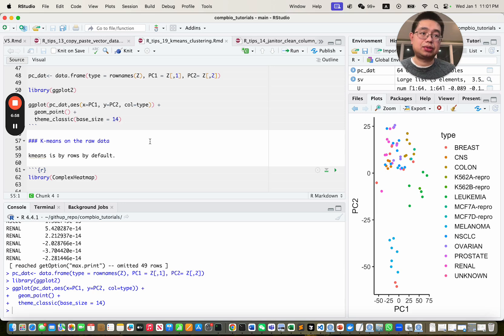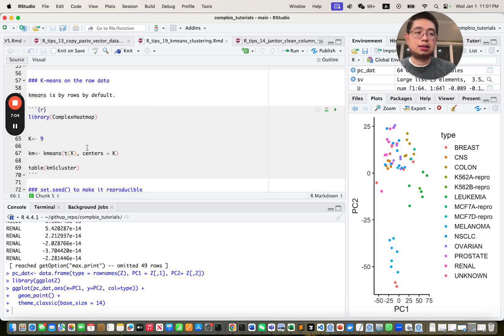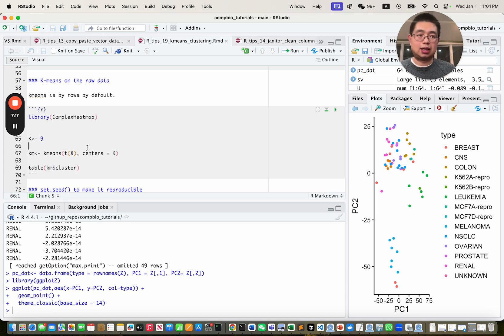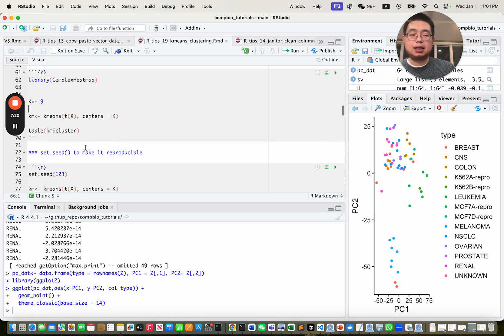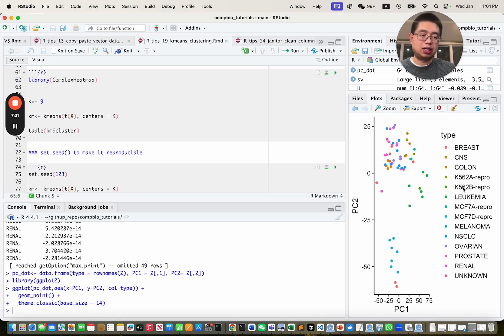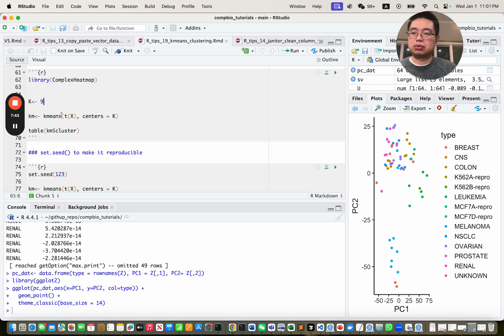Let's do k-means clustering. We can use the raw gene expression data or the PCA space — let's see how both look. As mentioned, k-means requires presetting k. I use k equals nine because there are 13 distinct cancer types, but some like MCF7a and d, or K562a and b, are probably similar. So k equals nine is an educated guess. Also note: k-means by default applies to rows, and since x is a gene-by-sample matrix, we transpose it to cluster samples.